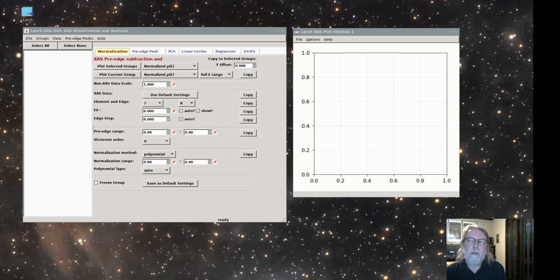In this video, we'll continue with that discussion of XANES and pre-edge peak analysis, but with a different set of data and with slightly different emphasis, going down the next step of what might be called machine learning. Hi, I'm Matt Newville, and this is part of the video series for using Larch for XAFS analysis.